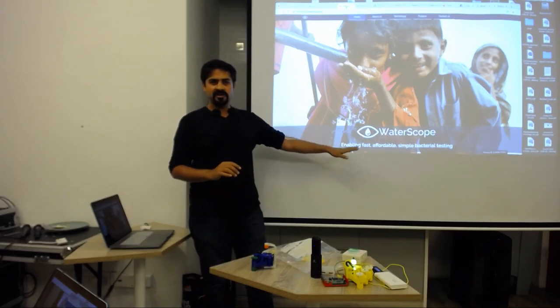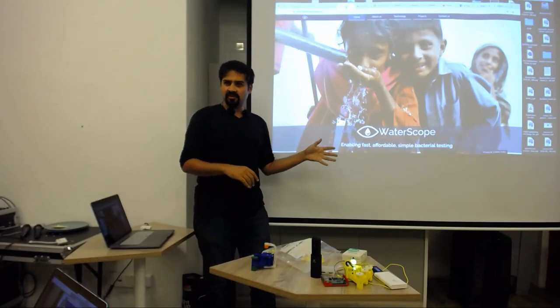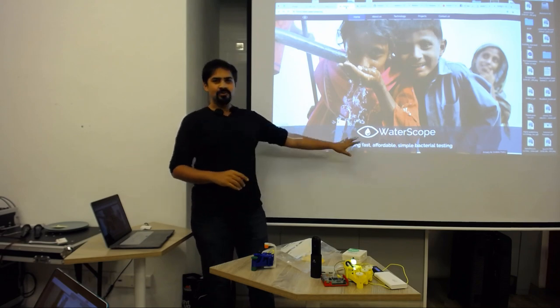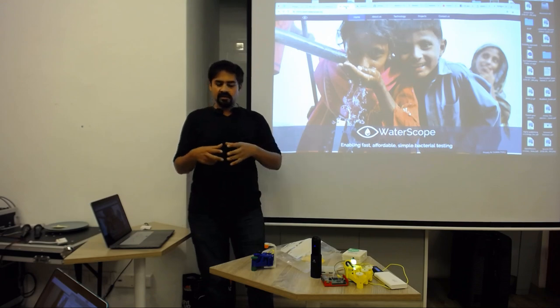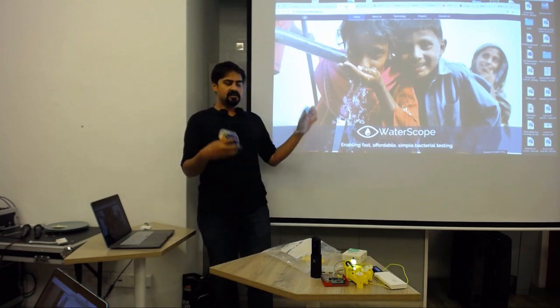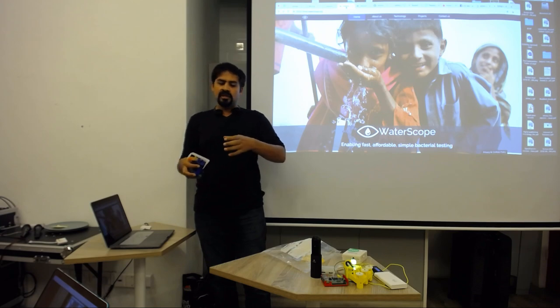It's called the Waterscope. And I have no affiliation with the company apart from I think they're doing some really, really cool work. There is a business model behind it. It is, just to get this out of the way, because I know we are in Singapore, they do try and make money off of this by making kits. And the technology behind this is a general purpose instrument. They use the technology behind this to make a specific purpose instrument to build cartridges.